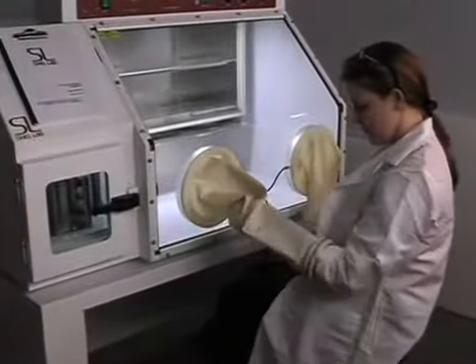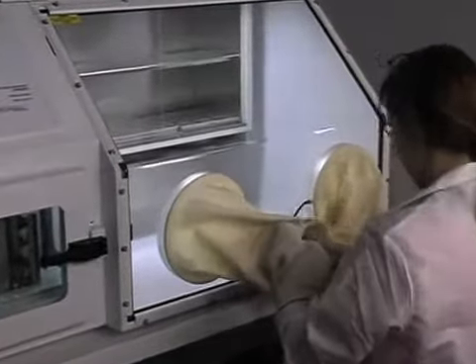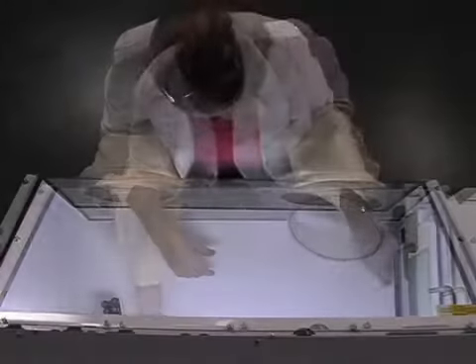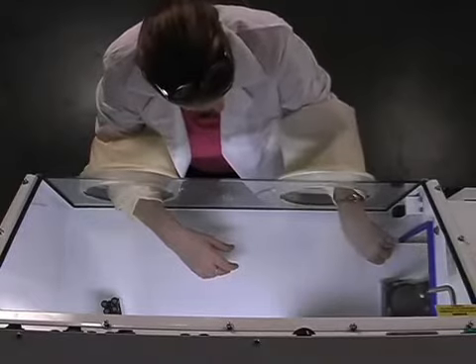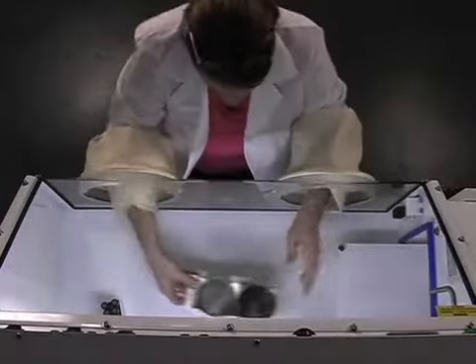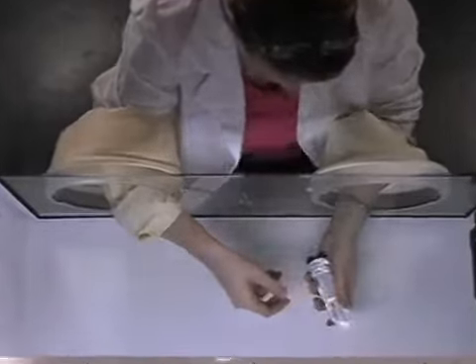The Bactron's unique vacuum seal design will hold this anaerobic condition for as long as necessary while the technician prepares to enter the chamber. Now that samples have been introduced into a strictly anaerobic environment, completing your work is worry-free. The gloveless design allows you to bring smaller items in through the sleeves rather than using the airlock system.